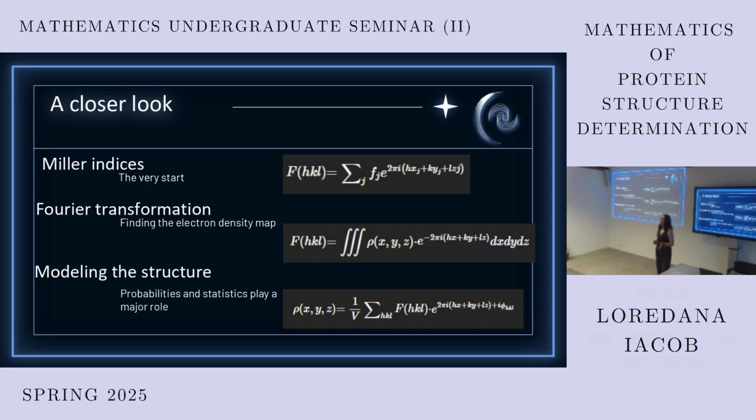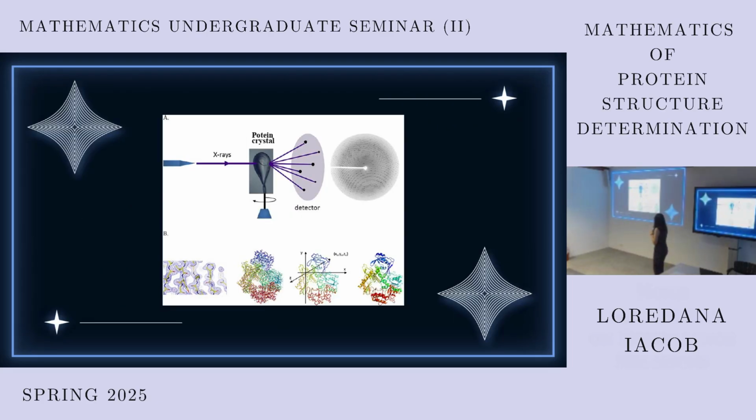And then we have the powerful computers that we use nowadays that are able to compute and model these very big results of the proteins, because the makeup of the protein is not simple, it's very complex. This being said, I hope I made you understand how we determine the structure of the protein.